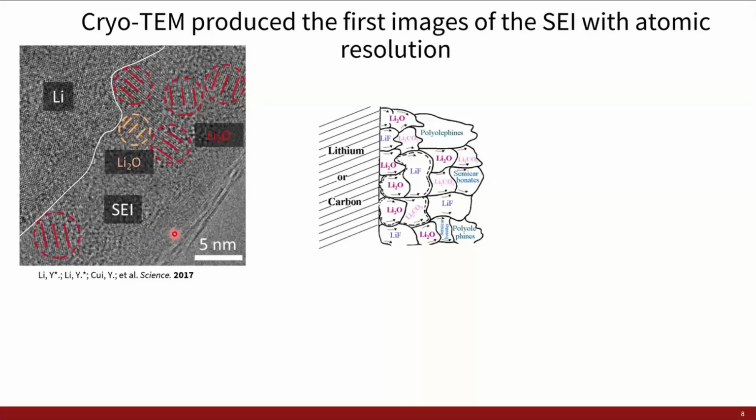But if you look more closely, you'll actually notice some discrepancies. Namely, we're not seeing certain components within the actual experimental SEI shown in cryo-TEM compared to what we should be seeing based on XPS observations. And specifically, what we're looking for is this component, lithium fluoride. So lithium fluoride, it's just one component. You might be wondering how important this is.